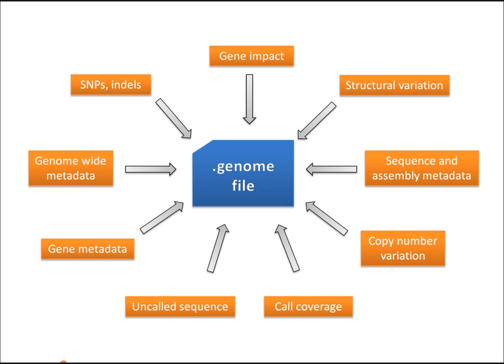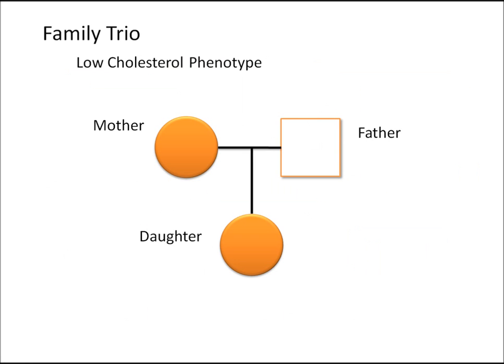Using this file is fast, very efficient, and is great for long-term storage of this genomic data. Now, we want to show you a real example of what you can do with this software. So, we're going to take a look at this family trio. The mother and daughter of this trio have an interesting low cholesterol phenotype, whereas the father has normal cholesterol levels. So, we're going to try to identify the root genetic cause for that phenotype.